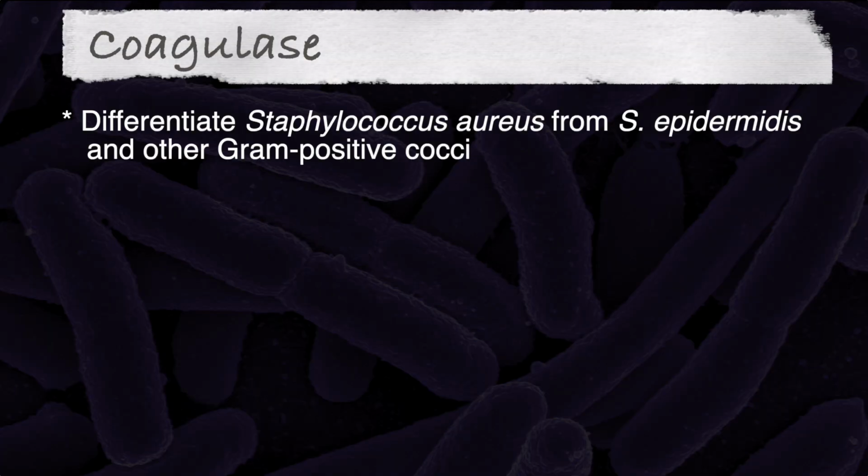The Coagulase Test is a differential test that allows us to differentiate Staphylococcus aureus from S. epidermidis and other gram-positive cocci.